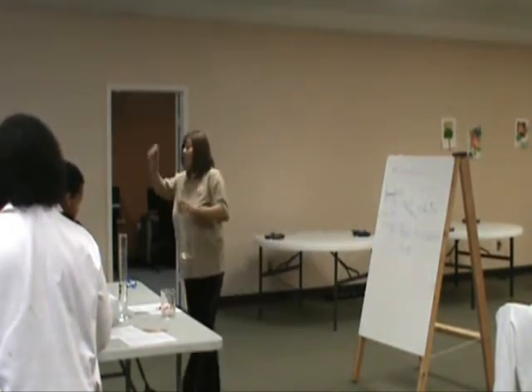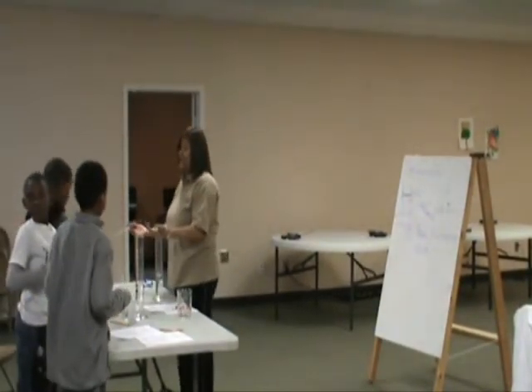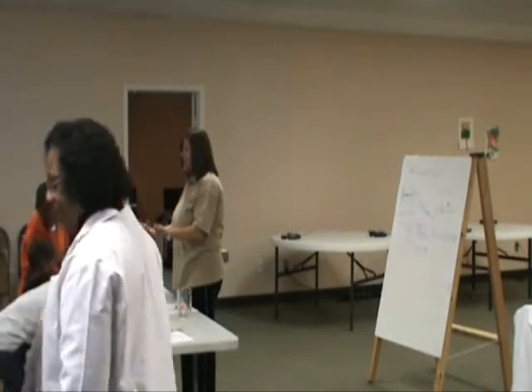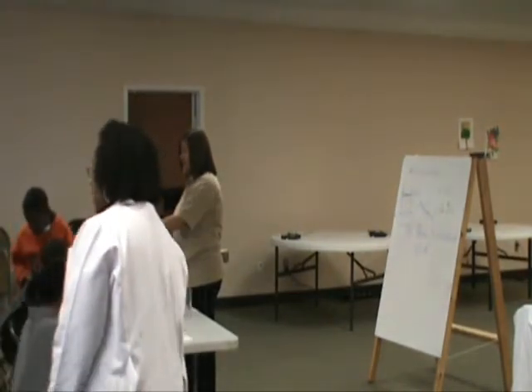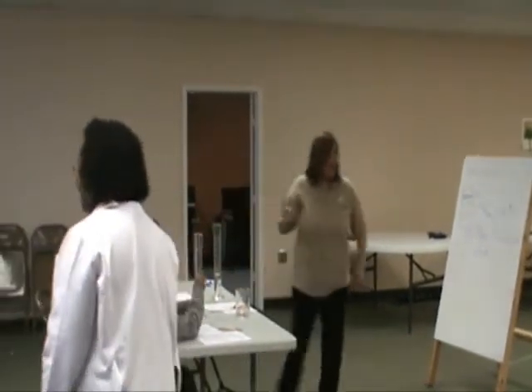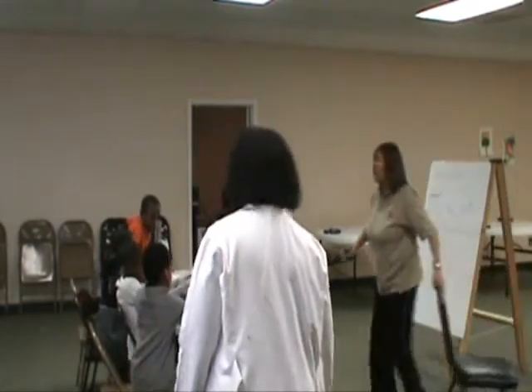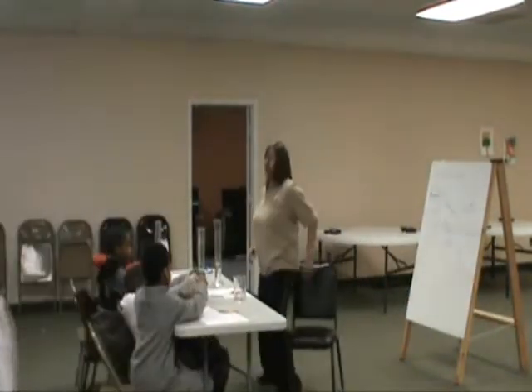So at this time, you're going to take it to eye level, and the best thing to do is to sit in your seat. Get in your seat and pull it up close. Not on your knees. Get back in the chair. Okay, I'm going to get in the chair as well, and I'm going to show you. We're going to walk around.